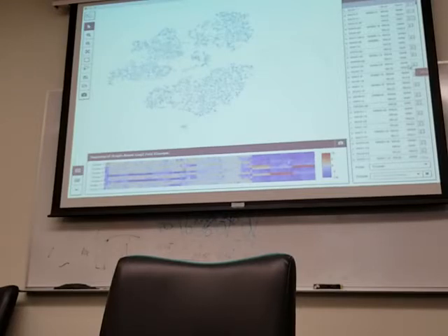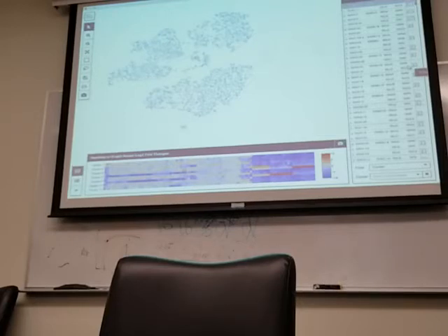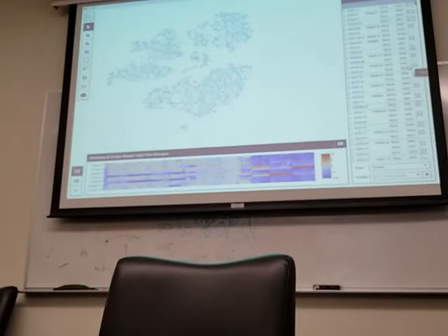Especially considering the light chain. So we can do that, that's easy enough. The question is then, what is your reference going to be? So suppose we have one sample, maybe a lupus patient that's undergoing a flare, and we characterize that. How are you going to know whether you just look at the V's only or look at the entire clonotype? How are you going to know that's abnormal, or different? Well, my approach to these things is look at everything. Yeah, I know that might be asking a lot.